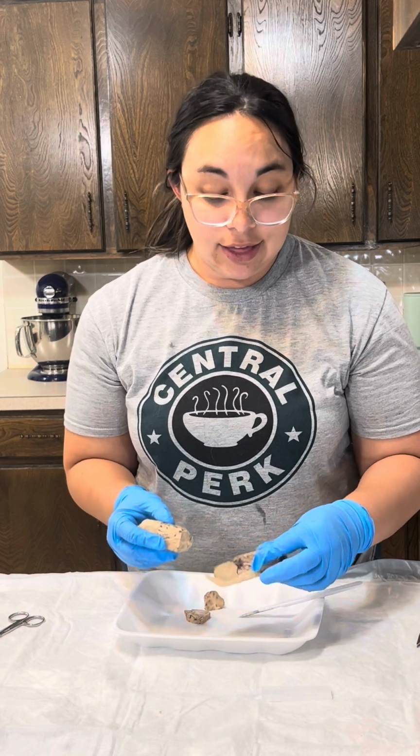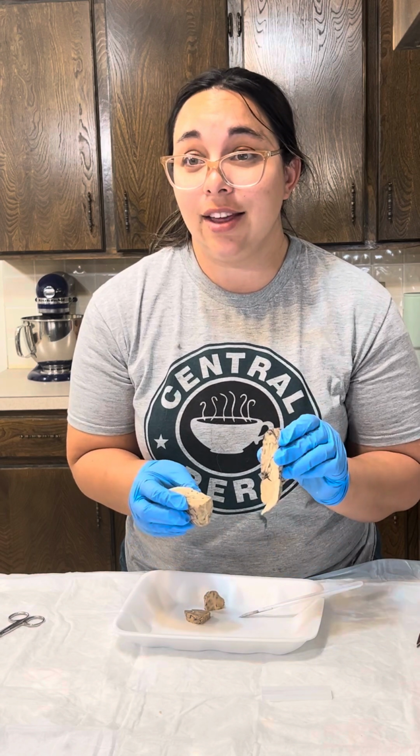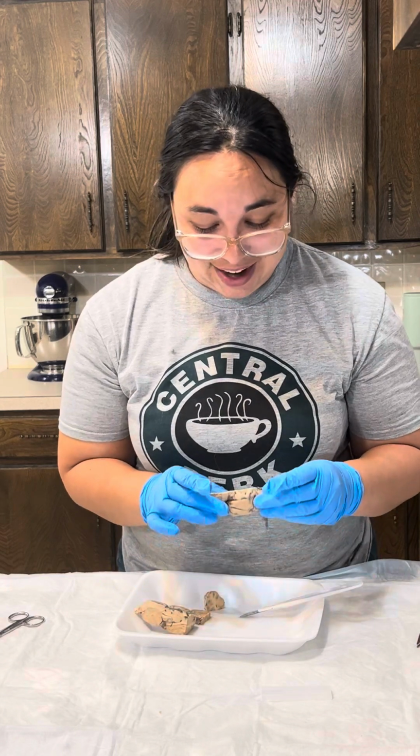I think those are all of the things that we needed to talk about on the brain. Do you have any questions? No? You're good? Is it as disgusting as you thought it was going to be? No. Oh, good. That's great. Okay, and I think that's the end.